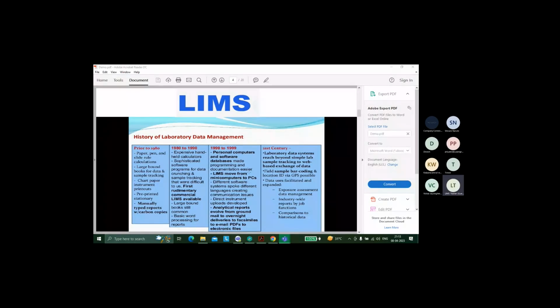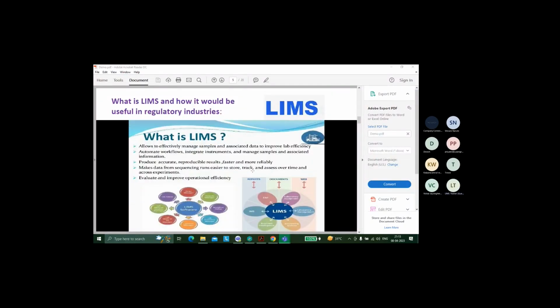So you see, there are a lot of LIMS creators, right? One is Labware. Each LIMS is based on its own programming language. Labware is built on which programming language? Those who are working on Labware, can you tell or guess? No one? Labware is built on a programming language known as Smalltalk. The company was founded by Vance Krishner, most probably a mechanical engineer.